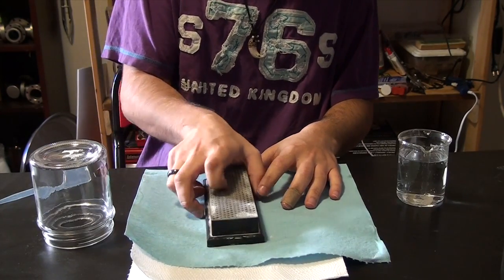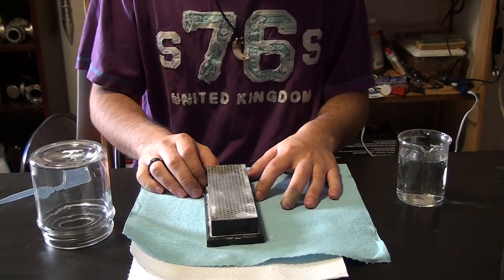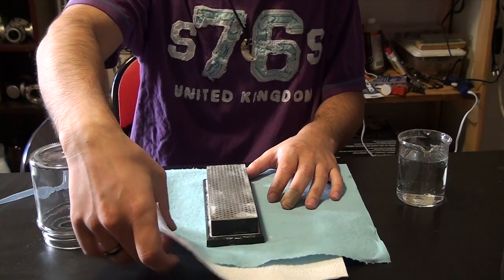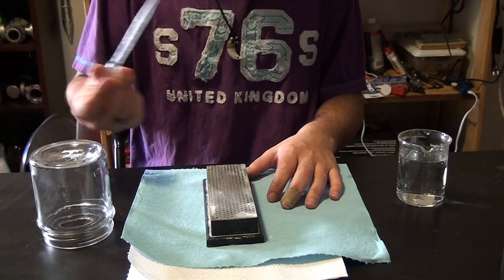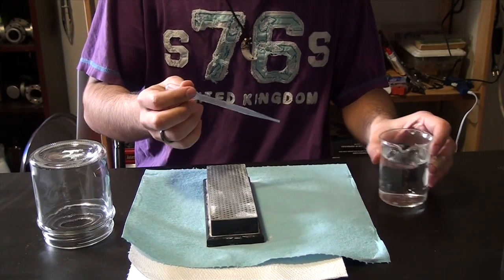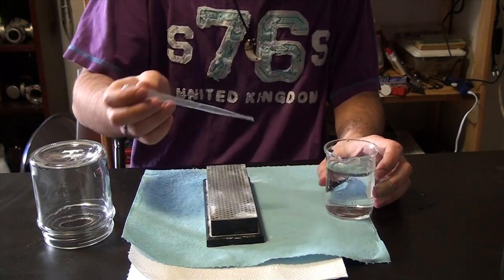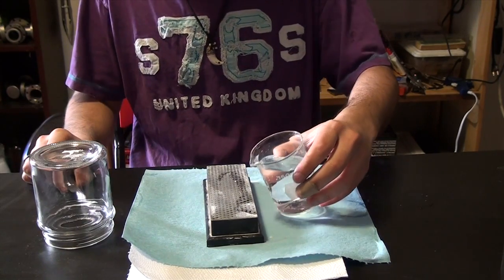To start off, you're going to need a coarse grinding stone. The really fine ones take forever, so I'm using a really coarse diamond stone. You're going to need a pipette, a little bit of regular water, and make sure to keep the stone wet.